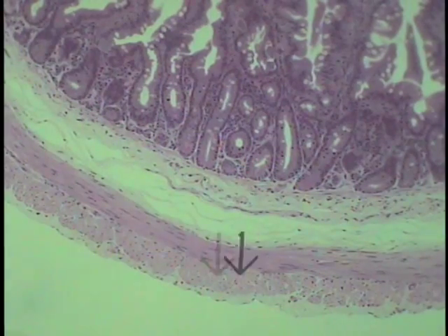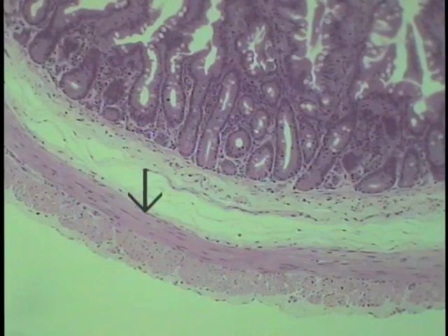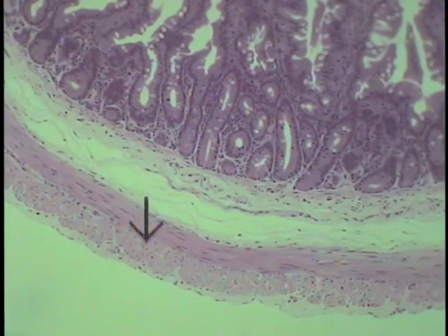Also shown is a well-developed submucosa, with the muscularis mucosae, the lamina propria, and the intestinal epithelium and glands making up the mucous membrane or the mucosa. This is the submucosa. Then the muscularis externa, which shows up quite crisply here, has its two subdivisions of an inner circular and outer longitudinal layer. And you can see, even at this magnification, it is limited by a serosa. That is that fine film of connective tissue covered by a mesothelium. The serosa is nothing more than the visceral layer of the peritoneum.